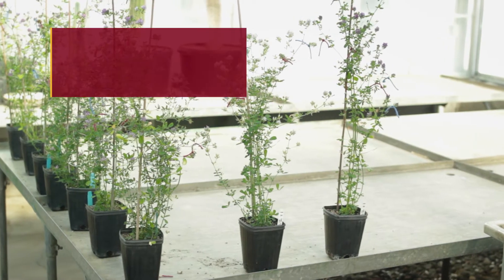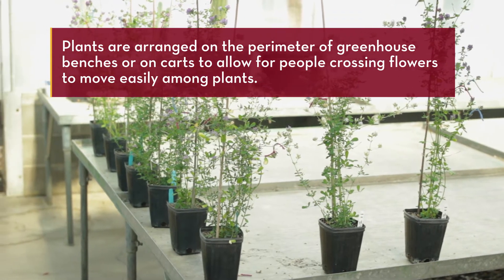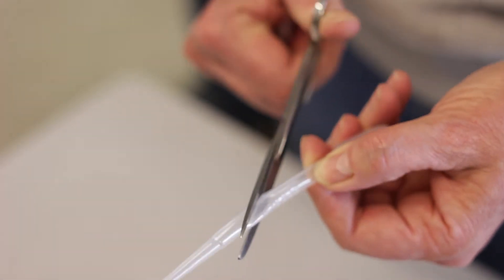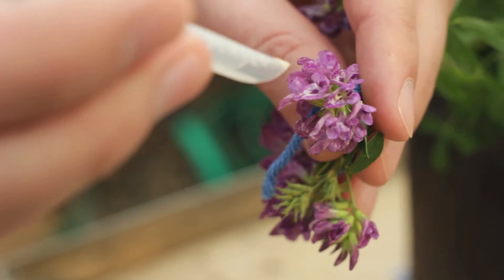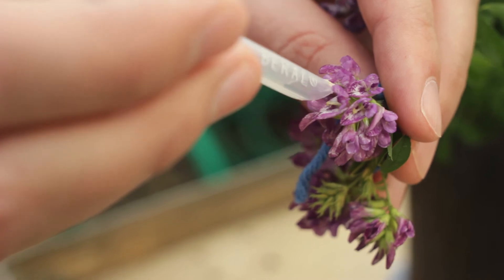The day of crossing, the plants are arranged on the perimeter of a greenhouse bench or on carts to allow the people crossing flowers to move easily among the plants. We make a crossing tool by cutting a plastic pasture pipette in half at an acute angle to achieve a sharp point. Crossing is then done by inserting the tip of the tool into the throat of the flower to trip the flower.